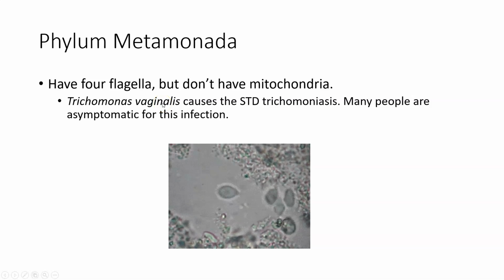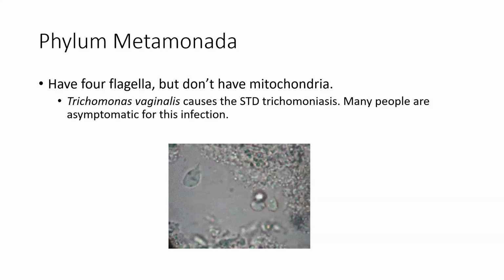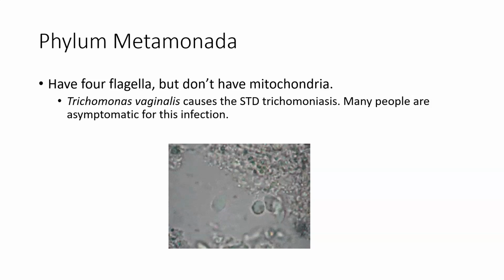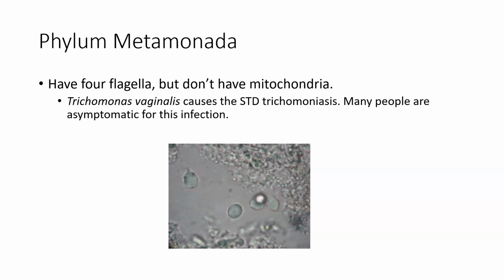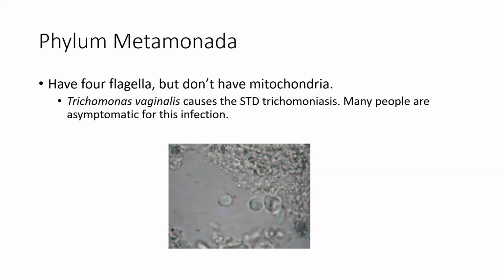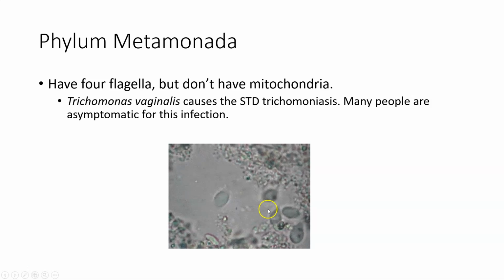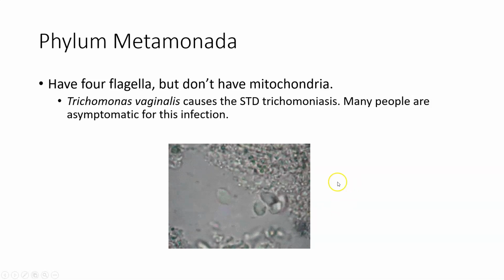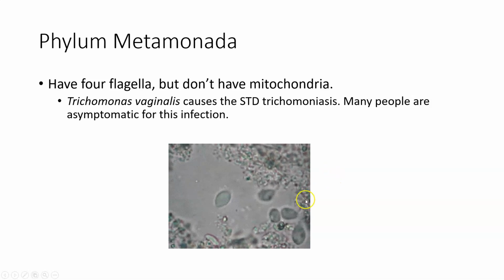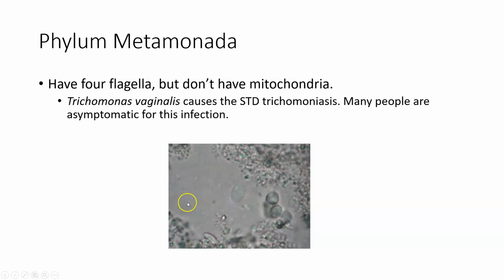So Trichomonas is an organism that causes trichomoniasis, which is a relatively common STD. It gets treated with antimicrobials that are kind of like antibiotics, but not, because this is not a bacterial infection. So penicillin, for example, would not work on this species, but there are treatments for this. Unfortunately, this one is also becoming resistant to treatment, just like the antibiotic resistance that we talked about with bacteria in an evolution chapter, though. So if you've ever had trichomoniasis, this is what's traipsing around in your genitals.